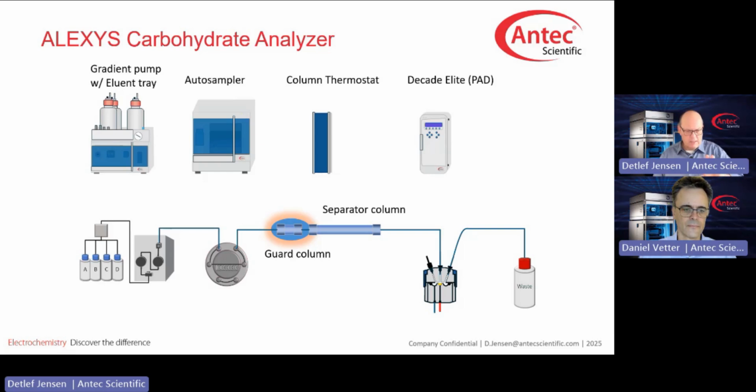If you look at the setup in front of you, we have a guard column, we have a separator column. Our guard columns usually are 5 centimeters, our separator column 20 centimeters. The total path length of the analytical separation is 25 centimeters. And out of these 25 centimeters, 5 centimeters represents 20% of contribution to the retention time.